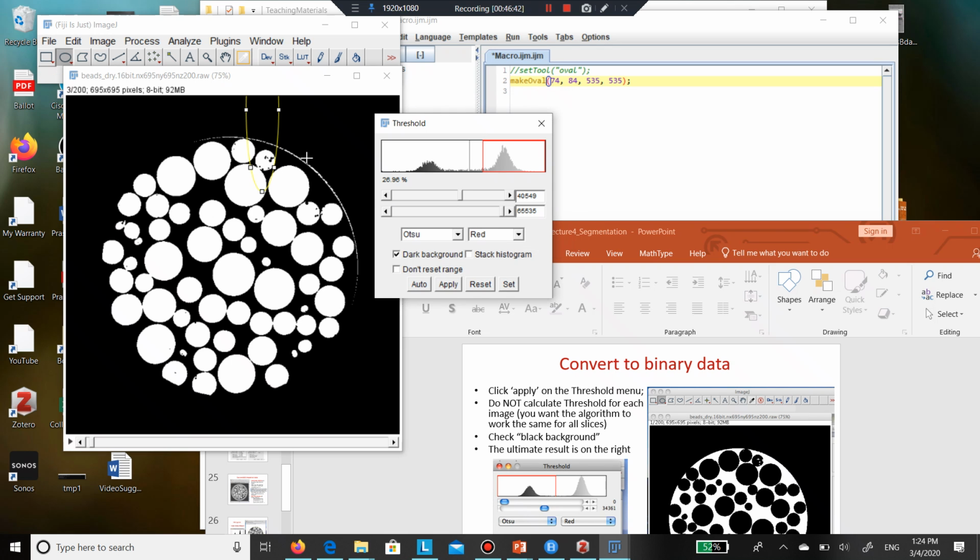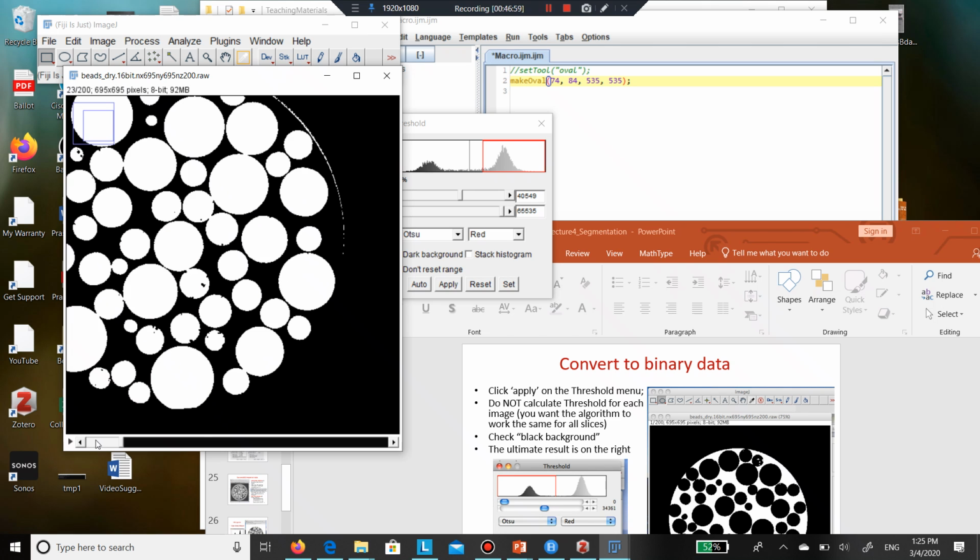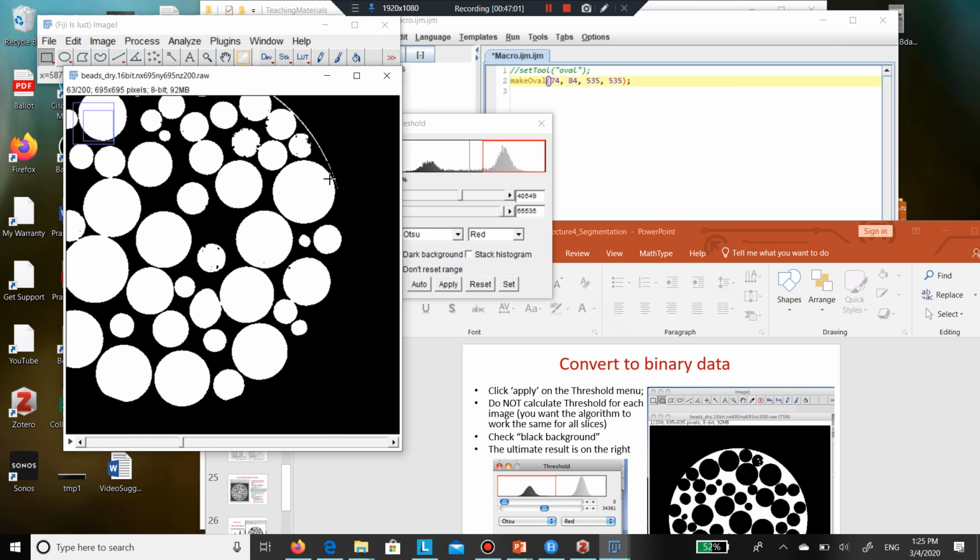You can see now how this problem with the boundary is showing up. I'm going to leave it here because it actually teaches something. You can see some of these issues that show up near the boundary.